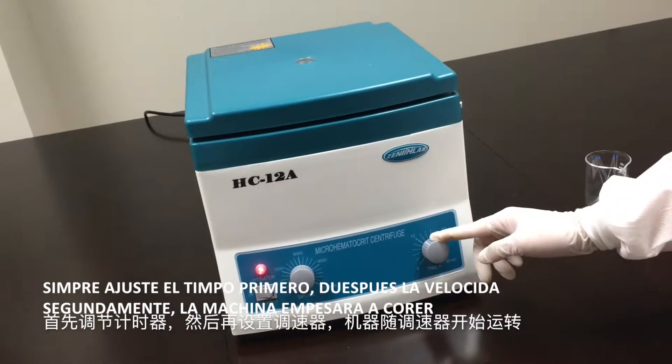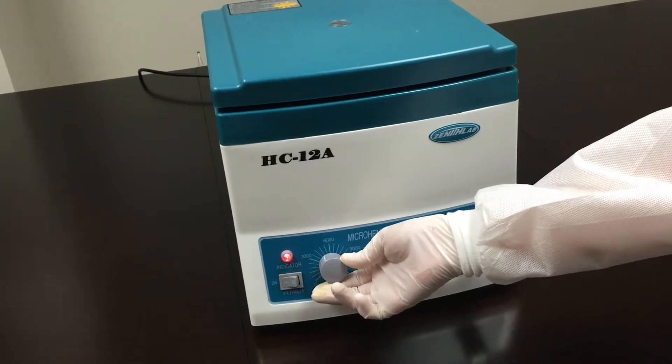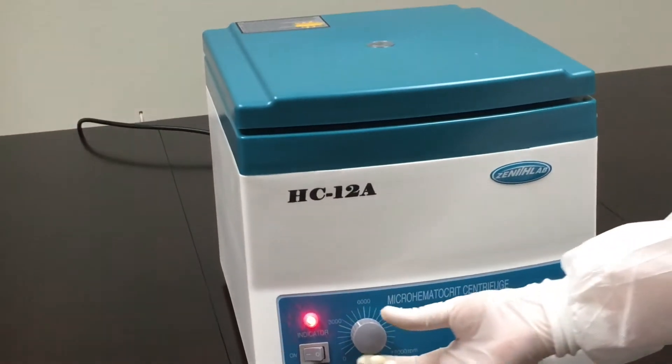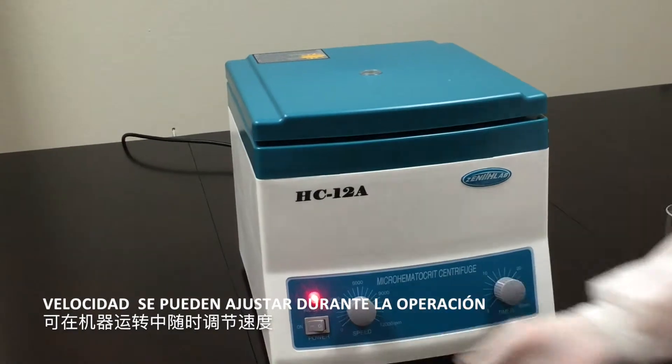Always adjust the timer first, then adjust the speed second. The machine will start to run once speed has been adjusted. Speed can be adjusted during operation.